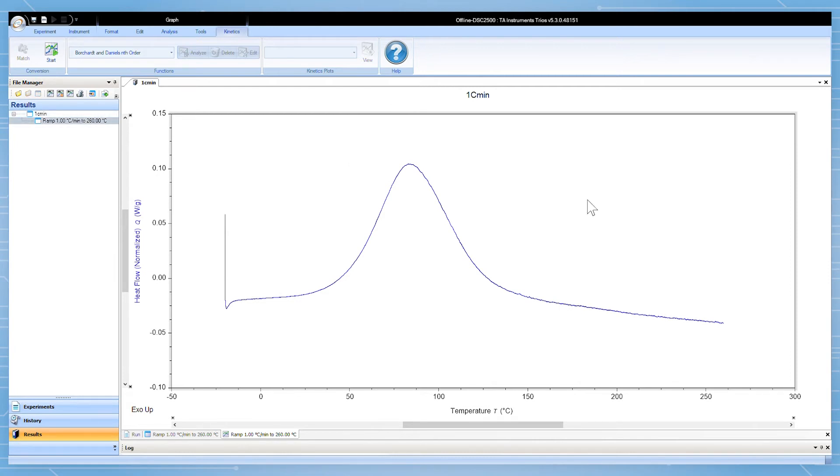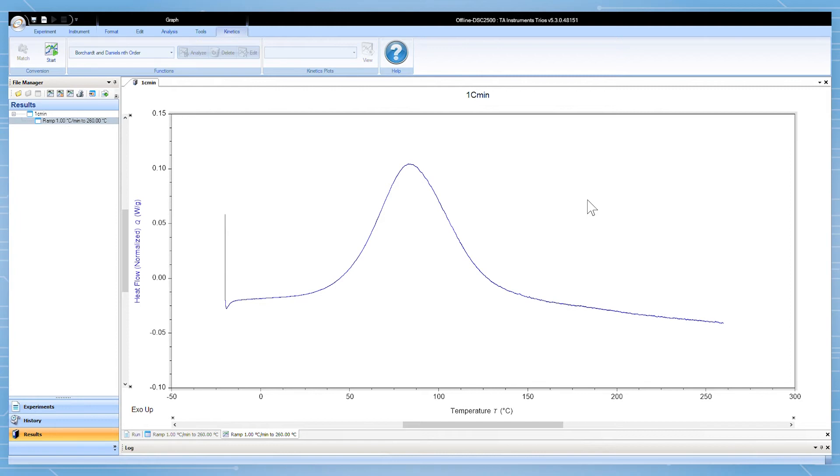Let's start with the simplest kinetics experiment, a single DSC run at a single heating rate analyzed using the Borchardt-Daniels model. Remember that this model makes some important assumptions such as the reaction being nth order and not autocatalytic. It's also generally only accurate for well-behaved reactions where the peak does not have shouldering, overlapping, or other deviation from a smooth peak.